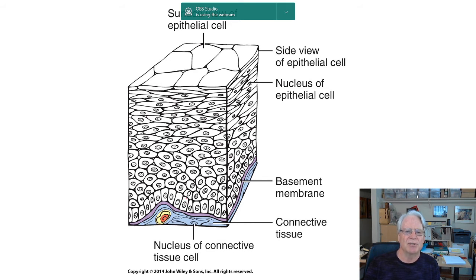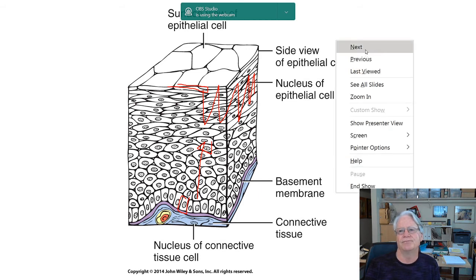These cells don't look particularly flat. These look flat. Why is it called stratified squamous epithelium then? Because this is my functional layer right here. That's where I get the function out of this tissue. Down here, these cells are dividing, they're maturing, they're going through a process of development, and as they go up to this surface, they're dying out and becoming flatter.